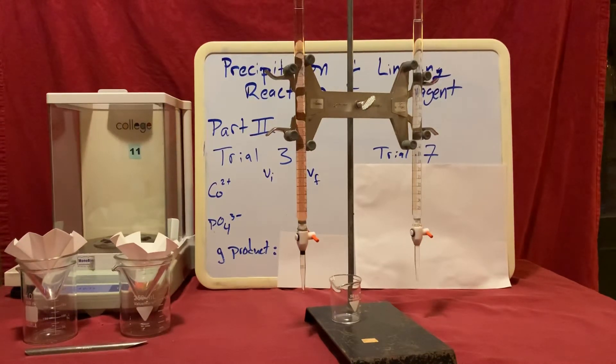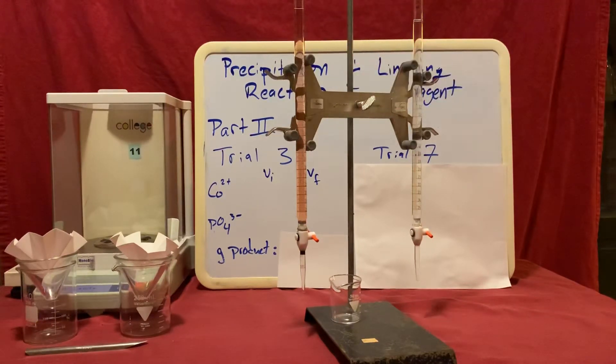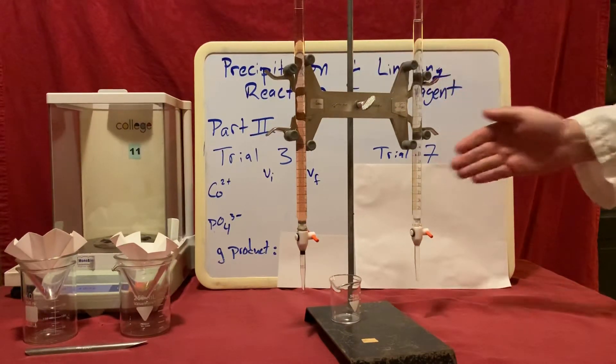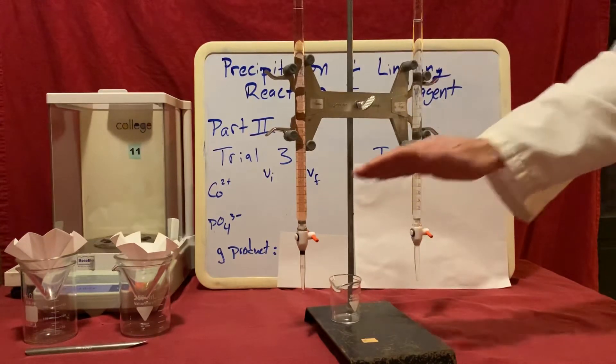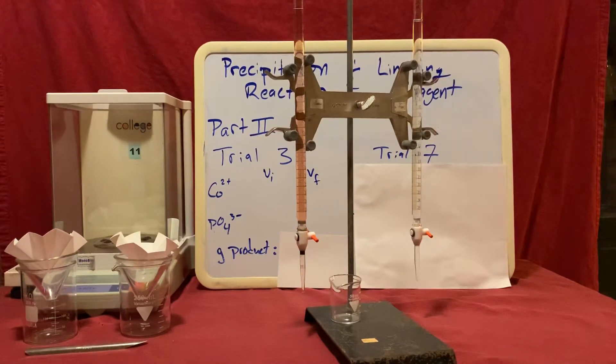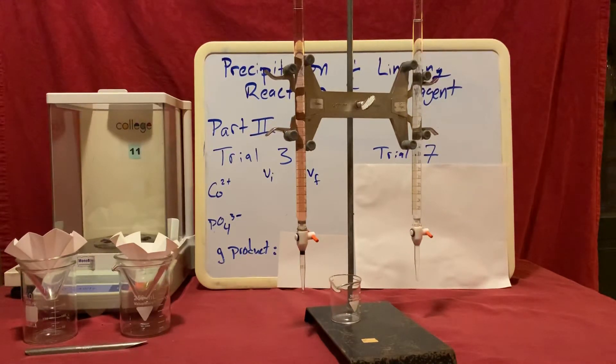For trial 3 I want to dispense approximately 20 milliliters of my cobalt-2 nitrate solution and 8 milliliters of my sodium phosphate solution. In order to do this I'm going to record my initial volume for each and my final volume for each. The difference between those two should be 20 for the cobalt-2 nitrate solution and 8 for the sodium phosphate solution.